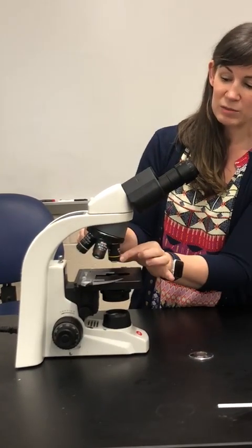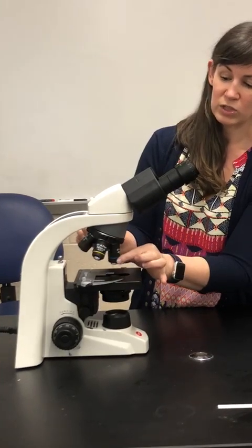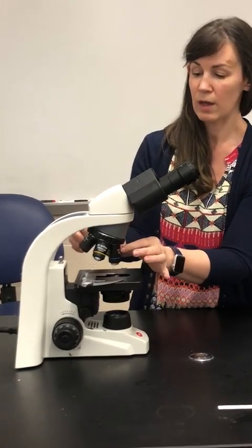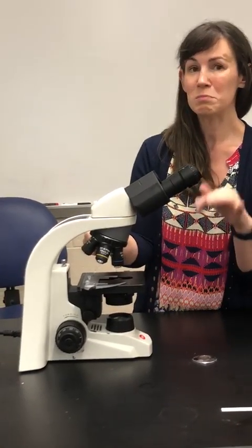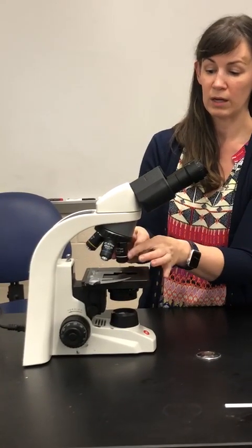Next we have our 10x objective that has a yellow ring. Then our 40x objective, which has a blue ring. You have probably worked with these 3 objectives before in other classes like Bio 111. The objective that we actually use the most here in micro is the 100x objective, which has the white ring.